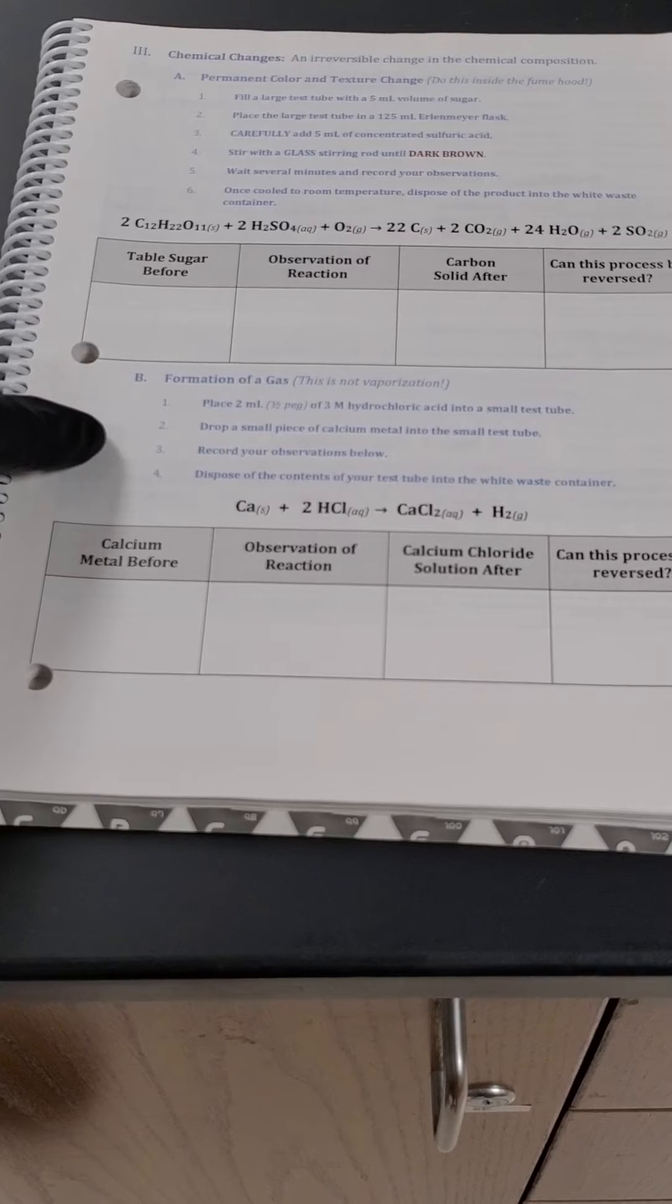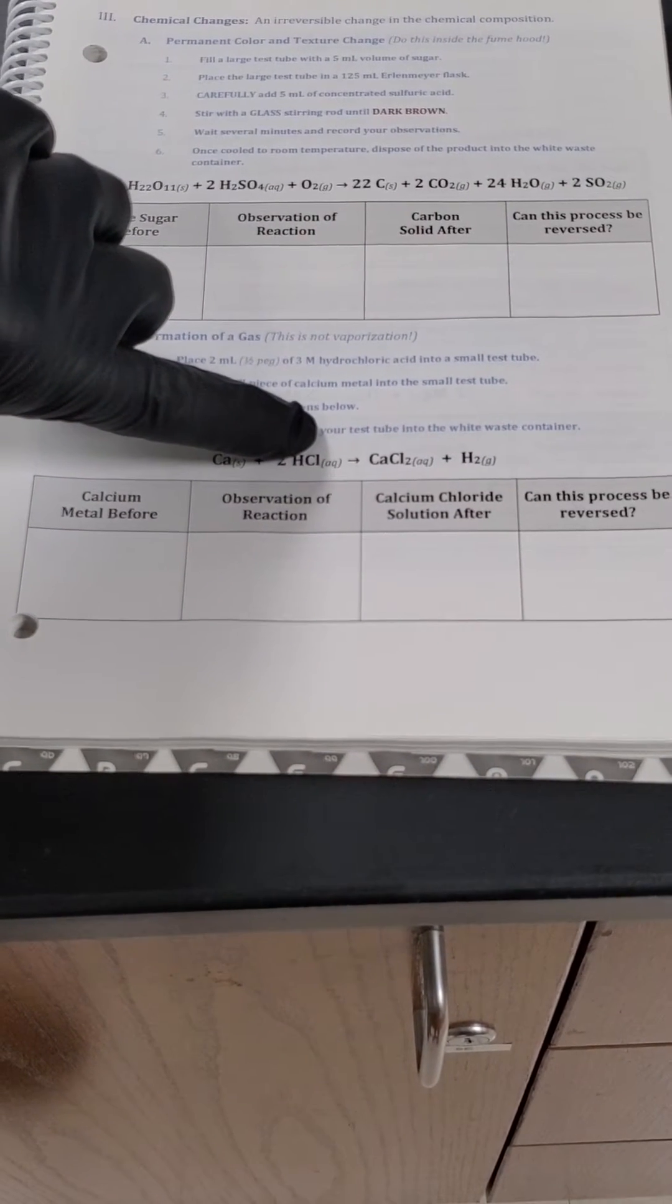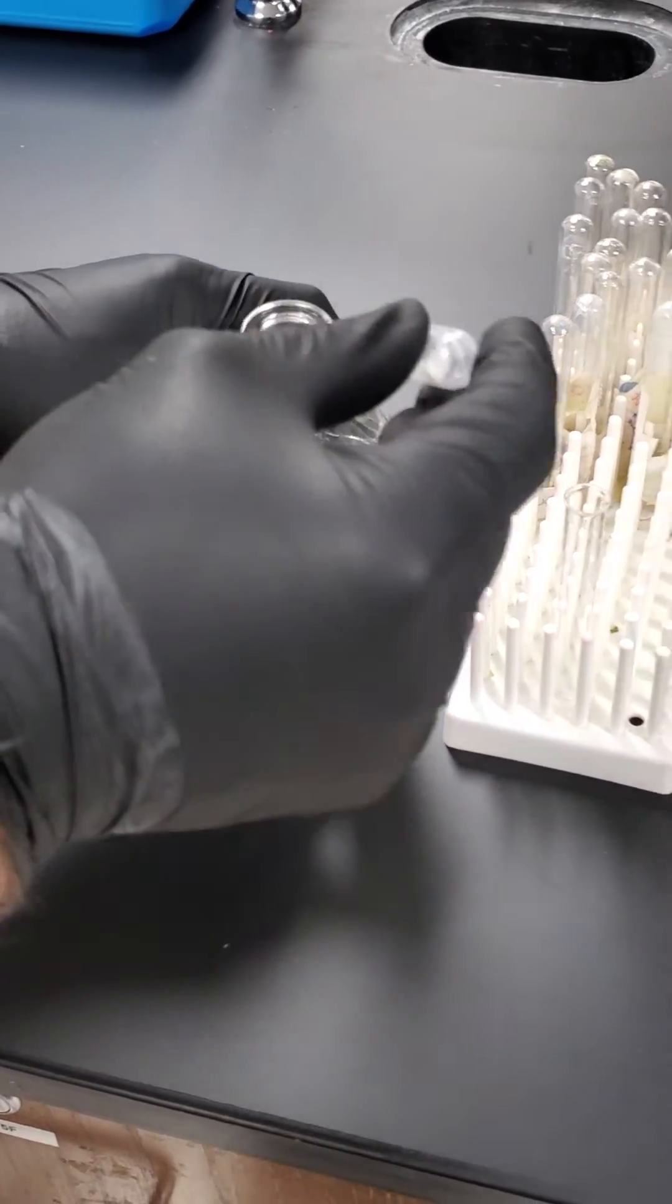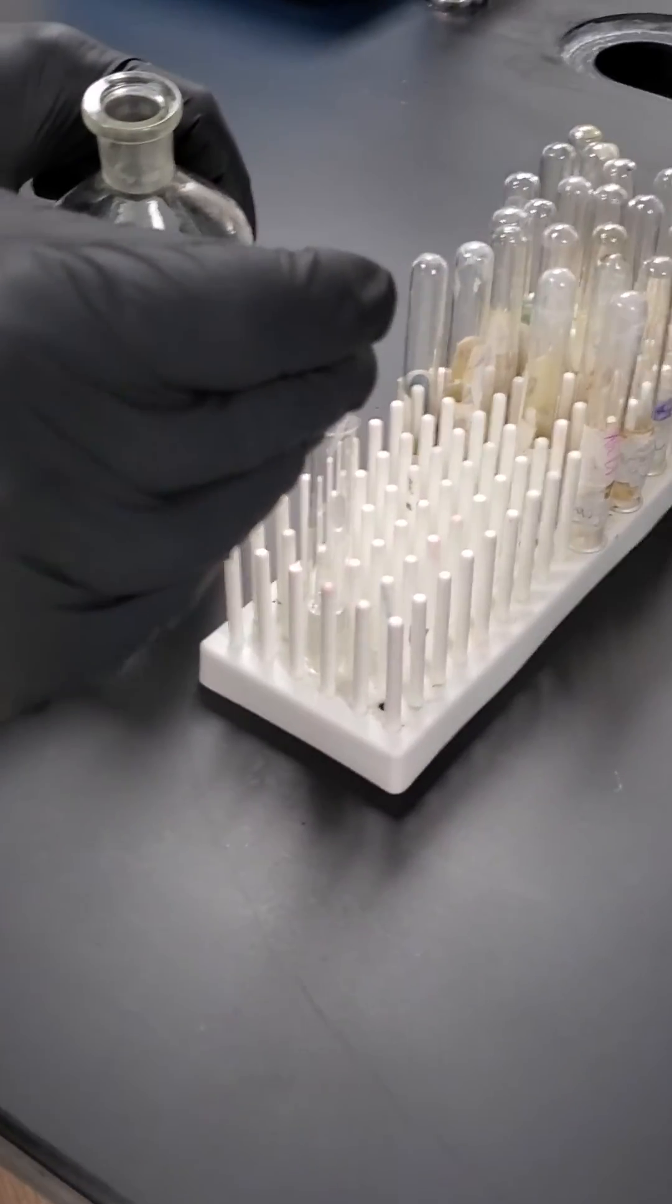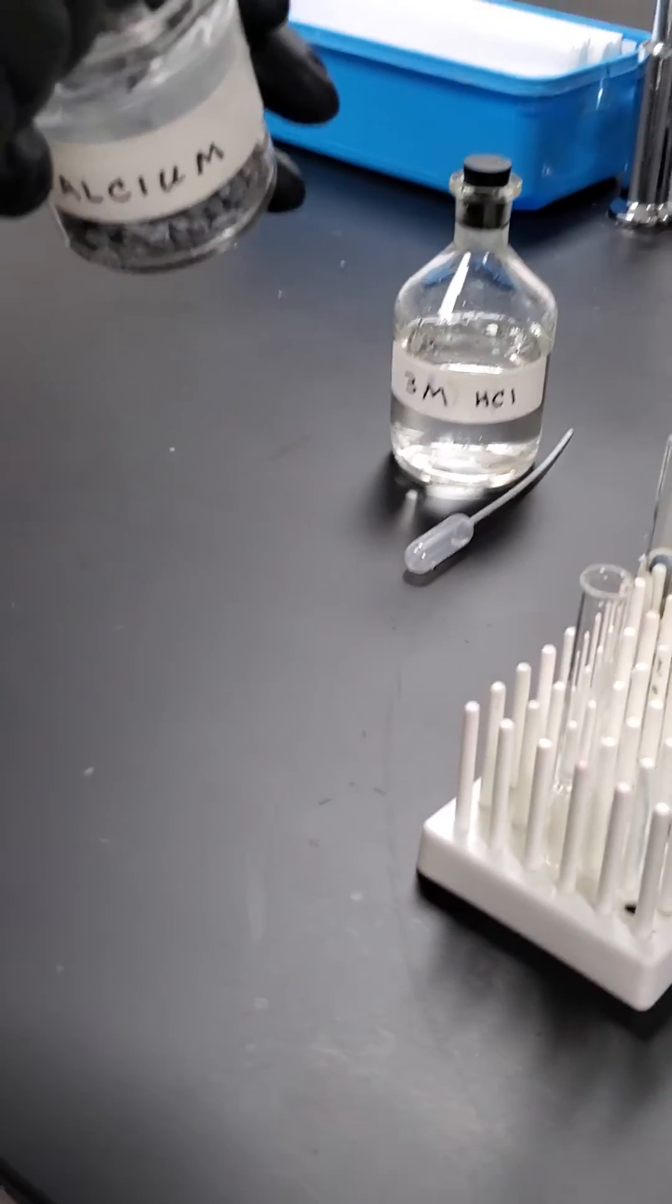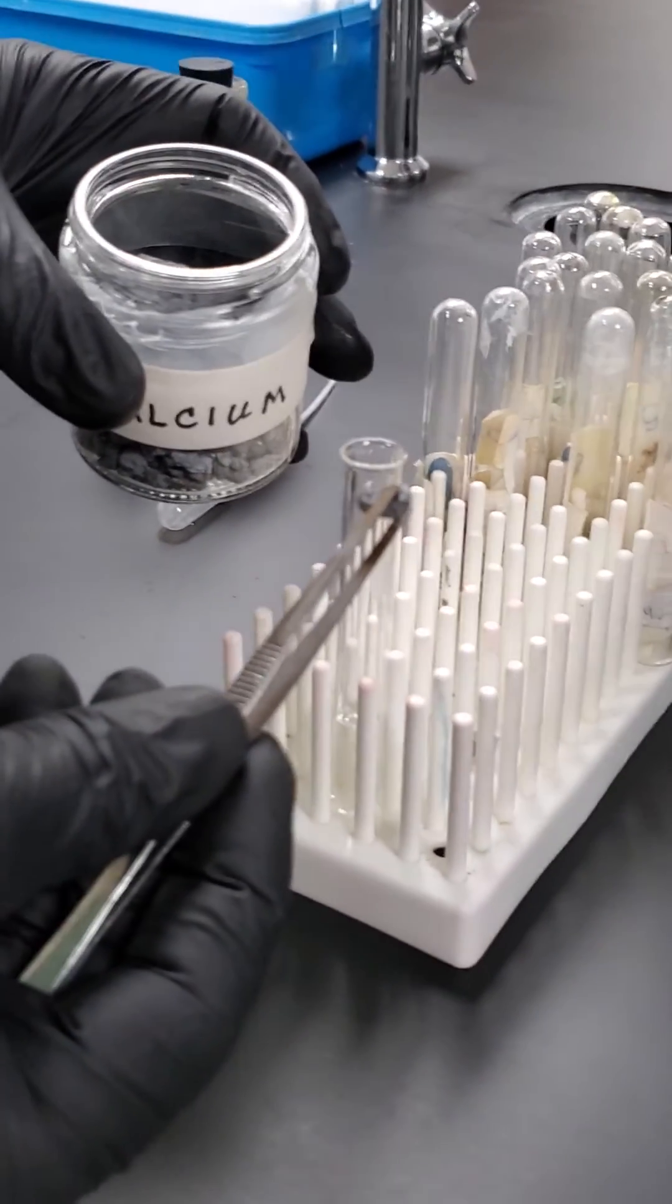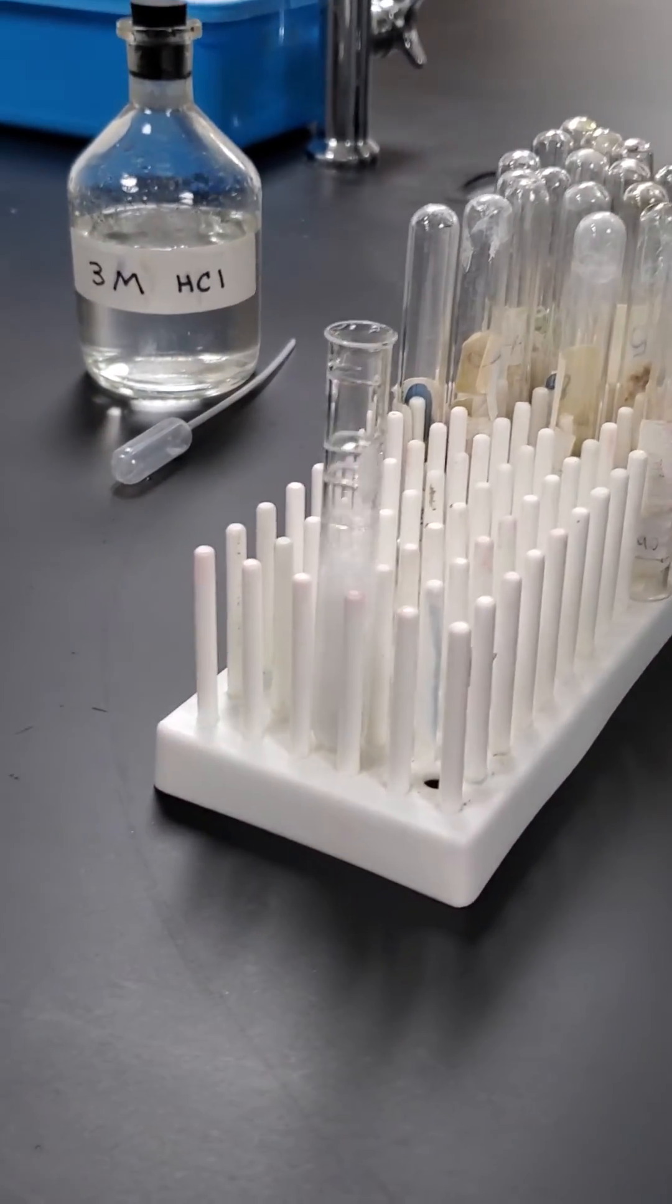Alright moving on to part B. We're going to show formation of a gas. Different from the change in color and texture of the last one. So we're going to add calcium metal to hydrochloric acid. Same acid that eats cement off of bricks. And see what happens. So to do this we're going to take a test tube. We're going to add some hydrochloric acid first. And then we're going to add some calcium metal. Doesn't like oxygen very well. Starting to corrode a little bit. But it's still going to do the trick. Let's find a big chunk and see what happens. So watch the bottom of the tube. Again here's the calcium metal before. Worried about the reaction and after. So notice a tremendous amount of bubbles.